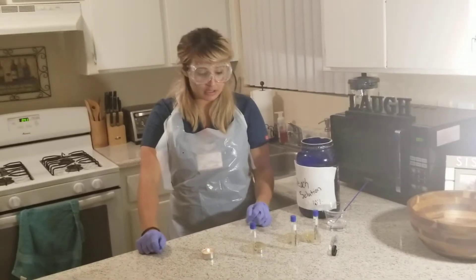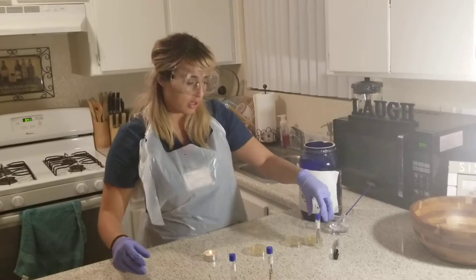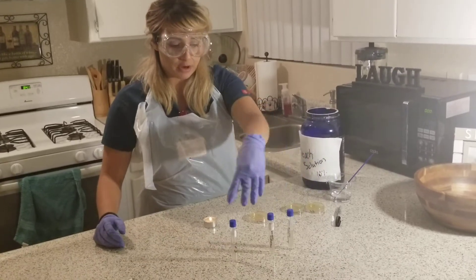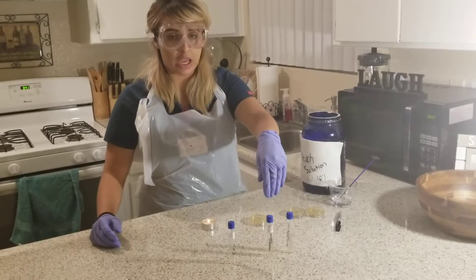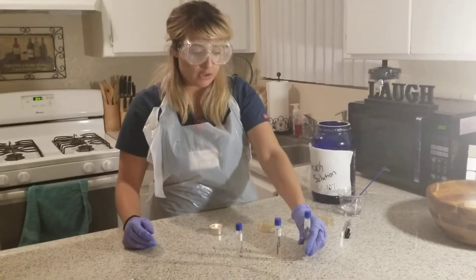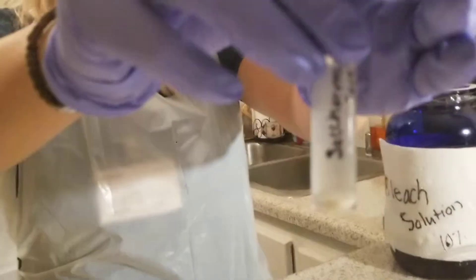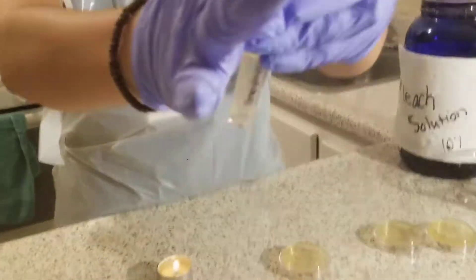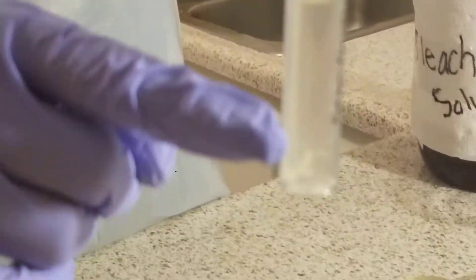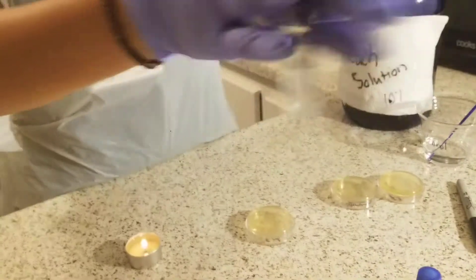In this lab, I will be continuing after growing my cultures in broth. I have all three broths that are nutrient cultures that have been labeled and there is now growth. If you look closely into the tubes, you can see the turbidity in all of the microbes. I've shaken them so that you can see the growth from the bacteria and the microbes in all of them.